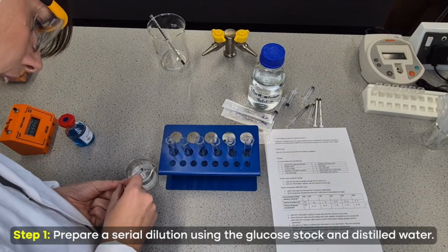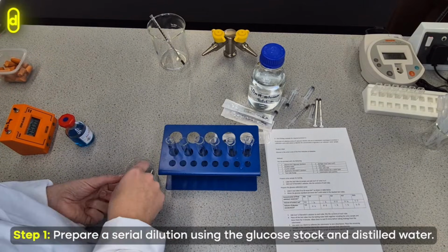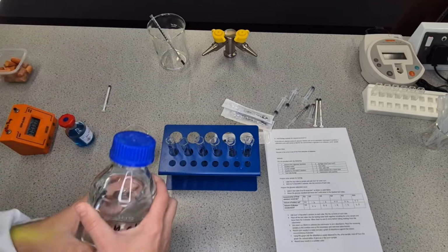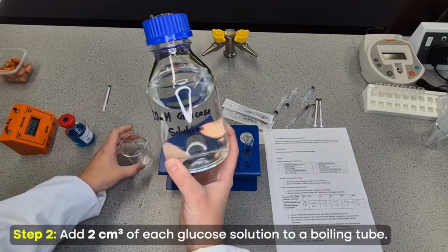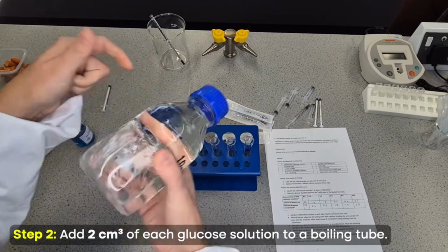Next is 0.8 of water. And then 0.4. And finally, no water. So next I'm going to do the same thing and pour my pre-made 10 millimoles of glucose solution into the beaker so it's easy to get out. Just going to give it a shake before I use it so it's definitely all mixed up.